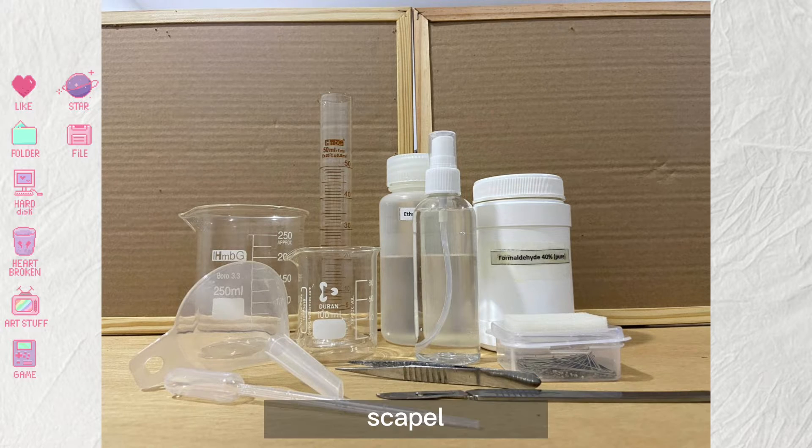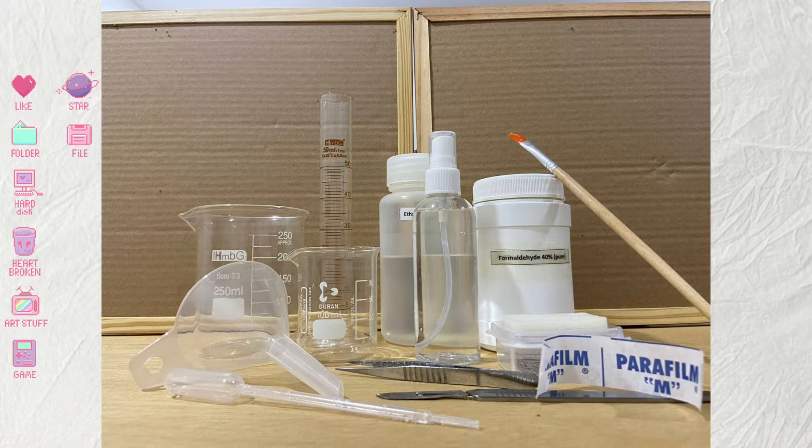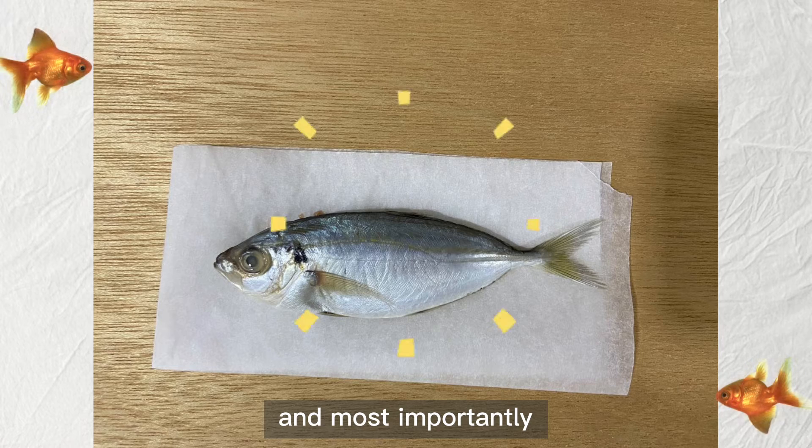You will also need some pins, clippers, scalpel, paintbrush, and parafilm. And most importantly, your specimen.